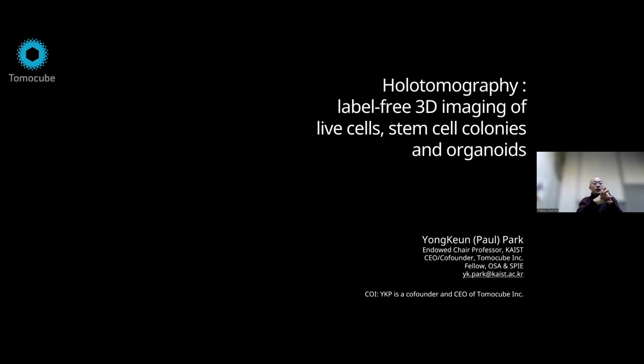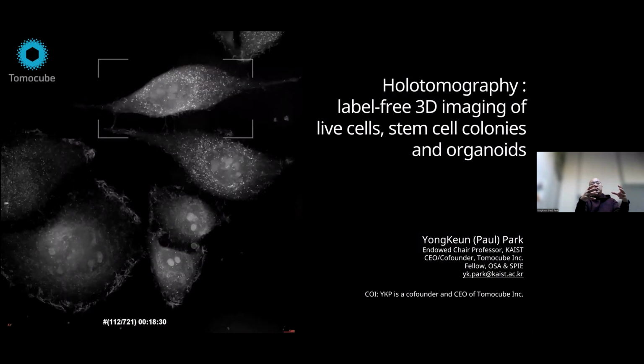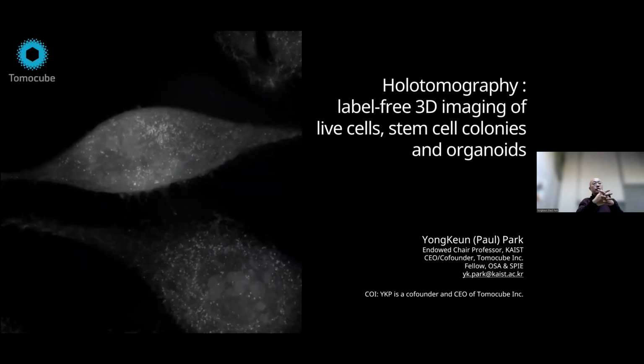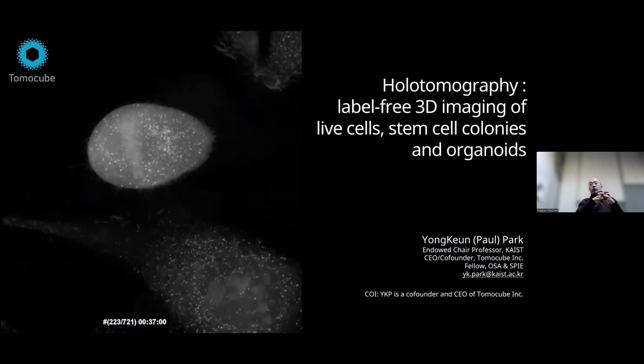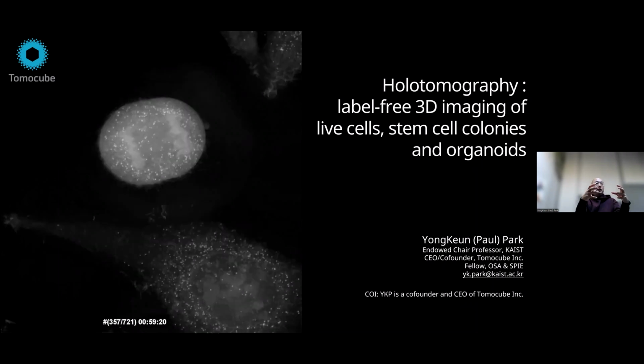Okay, good morning. Thank you for joining this webinar. I'd like to talk about holotomography, from the principles and the benefits of using holotomography to some examples of how we can utilize it in typical bioscience studies. To make a long story short, I'd like to share what it can provide using HT. It can provide three-dimensional high-resolution imaging of live cells, tissues, and organoids without using any labeling agent. So no fixation, no staining, no fluorescent proteins, but you can see subcellular dynamics.